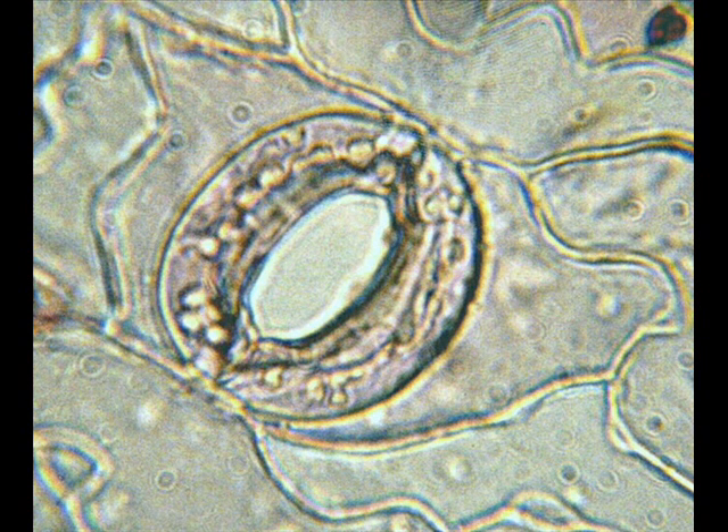This is the third sketch you'll need for Part 1 — a stomata on high power, which is 10 times 40, or 400x magnification. Make a nice detailed sketch of the stomata. You can see in the middle that the stomata is wide open, so this plant is undergoing photosynthesis.